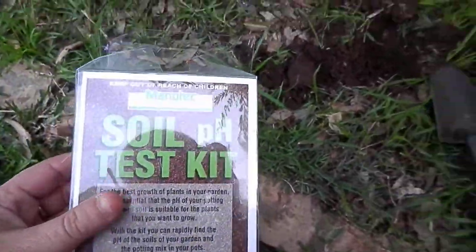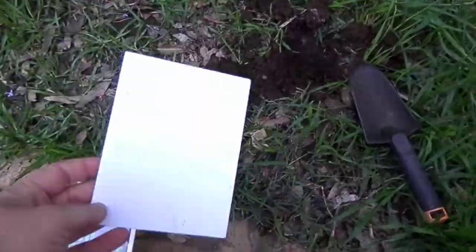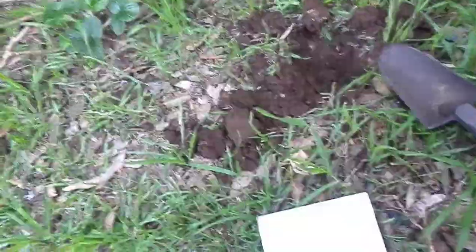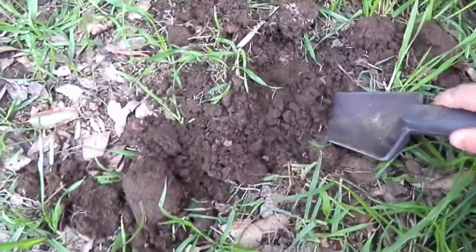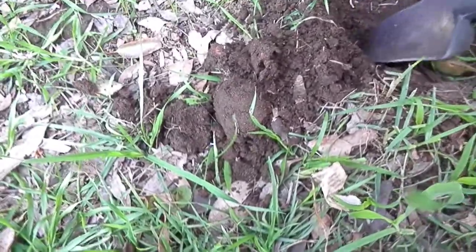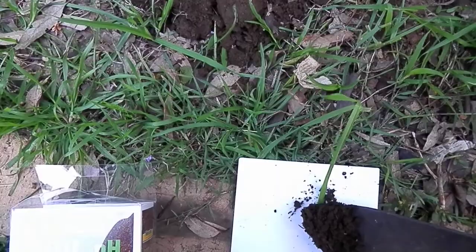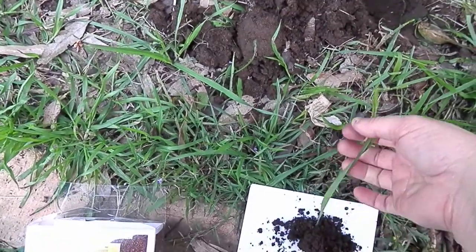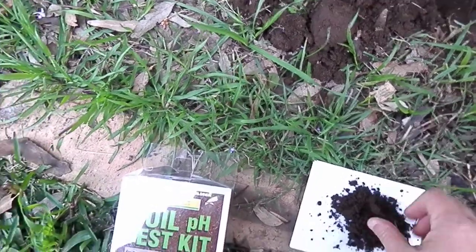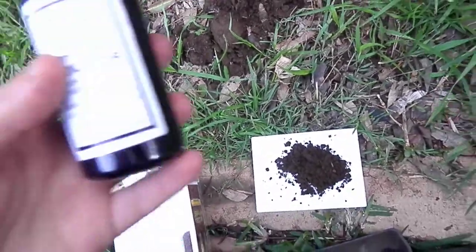Some of you probably already know how it's done, but pretty much you get your base here that comes in the pack and a bit of soil, preferably without any leaves or anything in it. Get this bit of grass out. And your dye indicator.